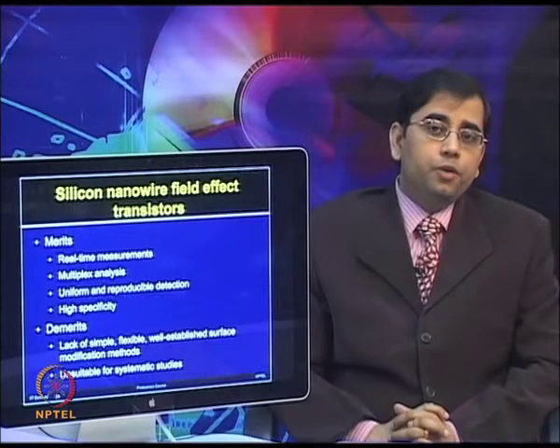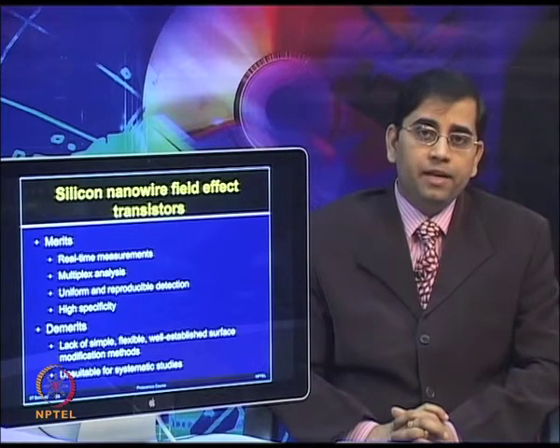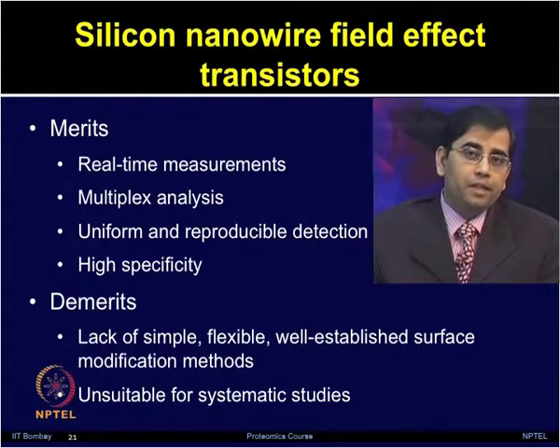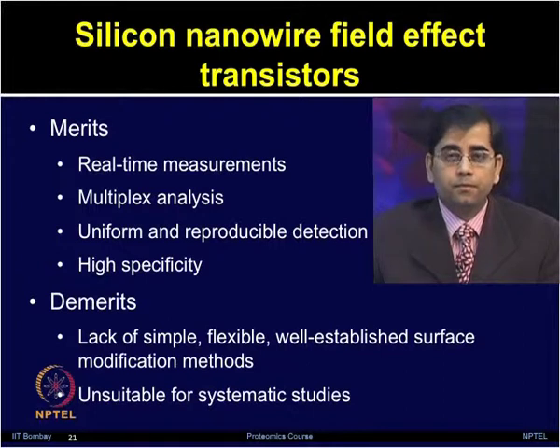So, continuing on to the silicon nanowire field effect transistors, there are different merits and demerits. This platform provides us the real time measurement capability. Also, it offers multiplexing analysis. It is uniform and provides reproducible results for various biomolecular detection, and it shows very high specificity.